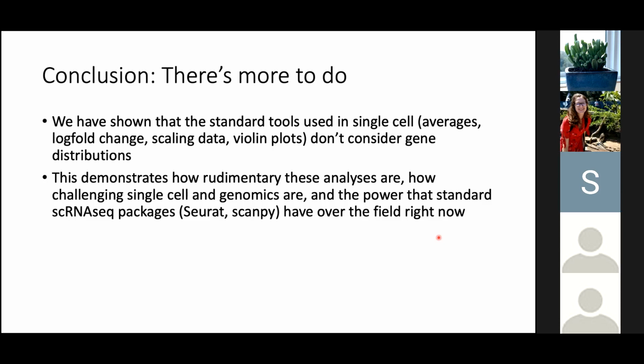It also might be because you don't really look at genes that are expressed in that manner, because those won't show up as your differentially expressed genes. What do you mean? Are you saying that there aren't many genes with an expression profile that includes values between the zero counts and the positive counts? Yeah, maybe you just don't look at those genes because they're not super informative. It's possible.